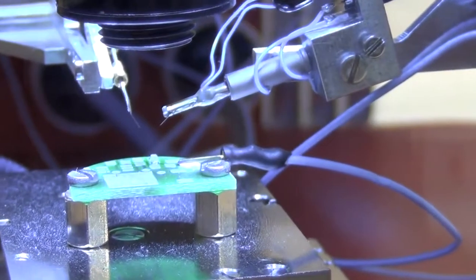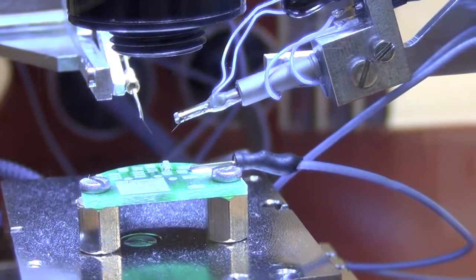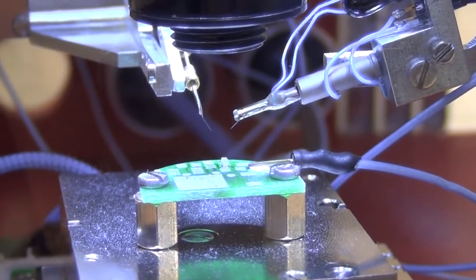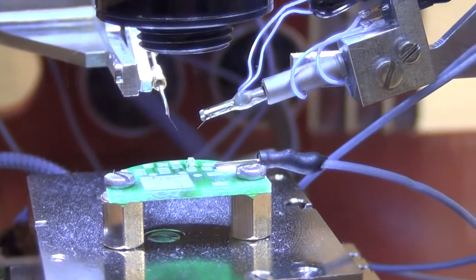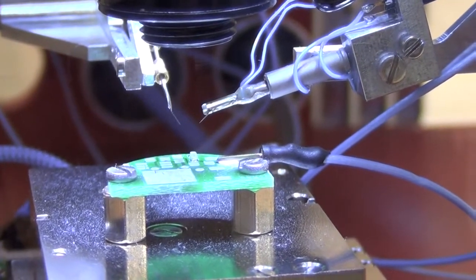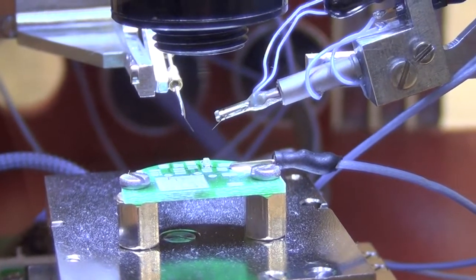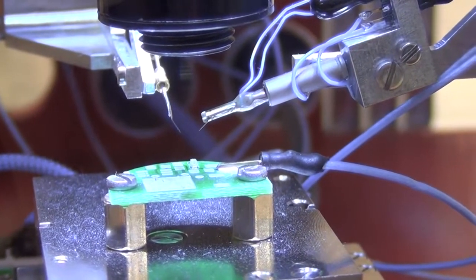On this exhibition we have prepared a demonstrator that shows the situation in an electron microscope. Instead of the electron source, we use a video microscope. And instead of the sample stage, we use our own sample stage. Now we have a task where we have to find a certain point on a sample and we don't know where it is.